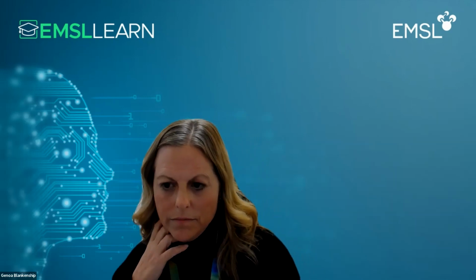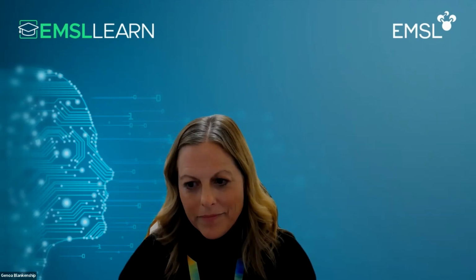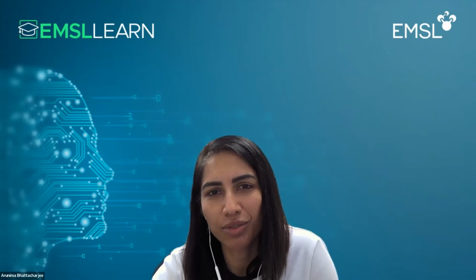Arunima, another question for you. Can you perform live in situ imaging on TerraForms platforms? Sorry, not yet, but we're in the process of doing that. Okay. And follow-up question, can you use the SubTap platforms as an incubation platform? Yes, you could send us plant roots. And if you want to look at spatial metabolites, we can do that just using the plant root. It doesn't have to be growing the plant from scratch.